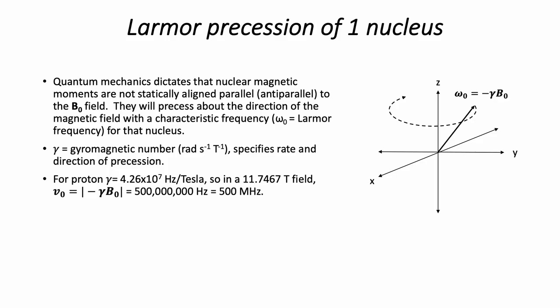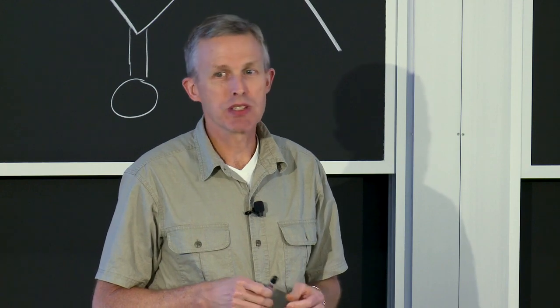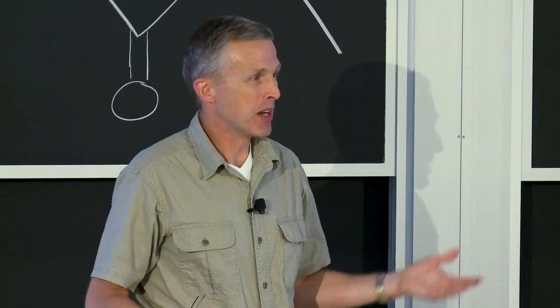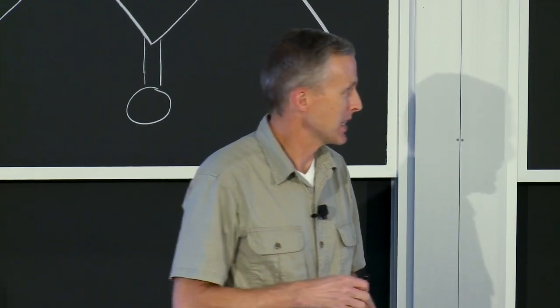And so when we talk about NMR instruments, as far as what size they are, they're not specified by the strength of their magnet. They're specified by the frequency that a proton precesses in a field with a magnet of that strength. So if you come down to the DCIF, I'll say I have a 500, or I have a 600, or I have a 400. In the undergraduate teaching labs, you have a 300, and I think the bench top is a 60 megahertz. And I'd have to go look up in a table or do the calculation how strong in Tesla a 60 megahertz NMR magnet is. But that's the way it's specified.